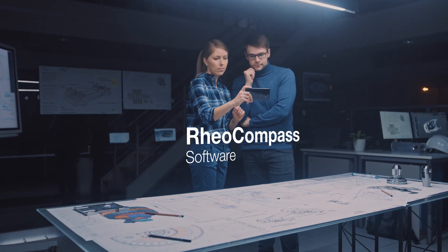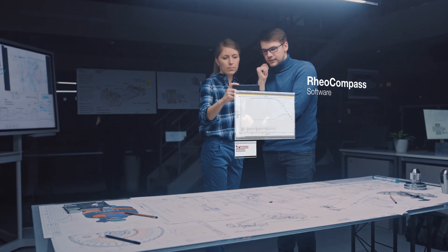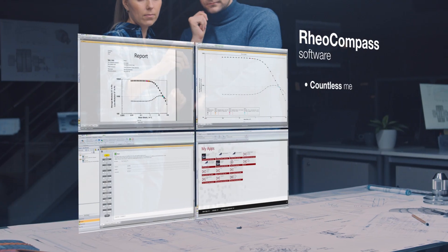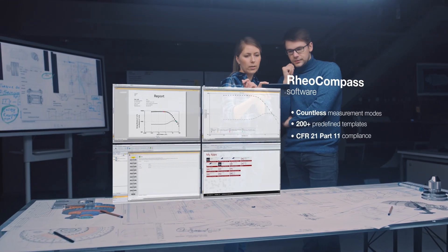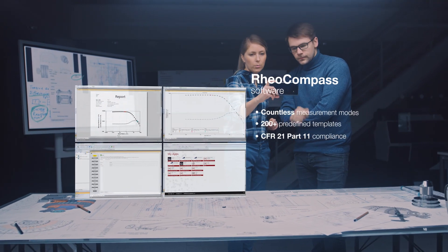Our RheoCompass software provides a spectrum of possibilities with countless measurement modes, 200 plus predefined templates, and top-level CFR 21 part 11 compliance.